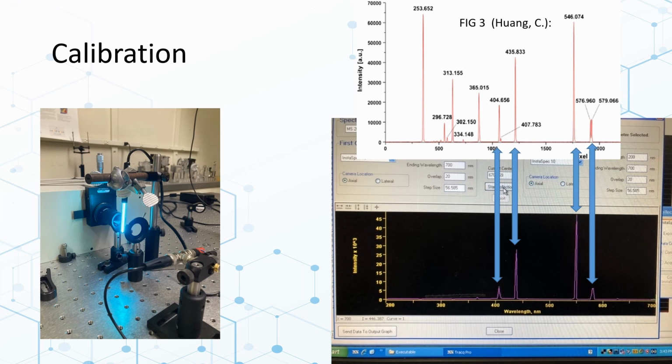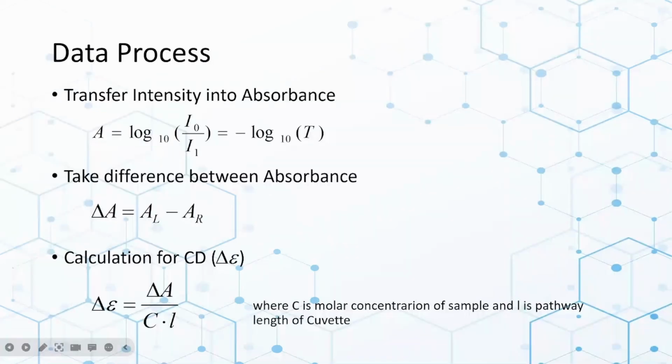As mentioned in the video, we used a mercury argon lamp to calibrate our system. The lamp provides accurate gas emission lines which can be utilized to verify and calibrate spectrometry wavelengths. These 4 peaks of our graph were indicators that we have successfully calibrated our monochromator and can produce accurate data.